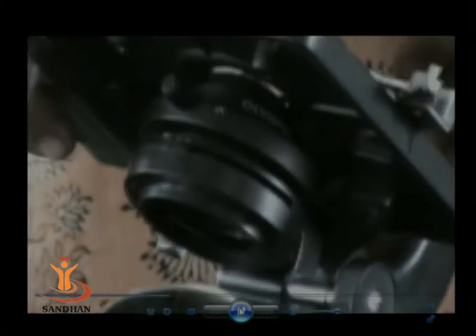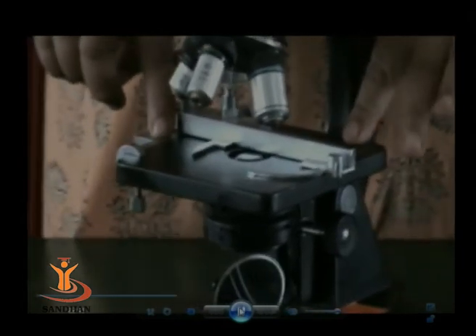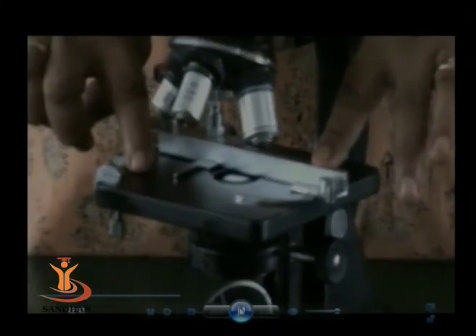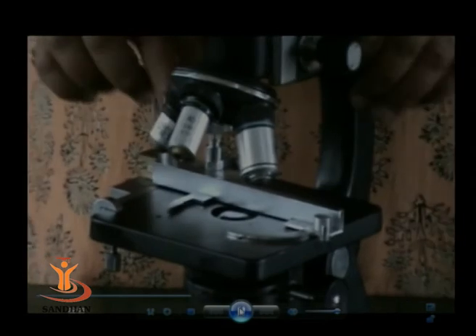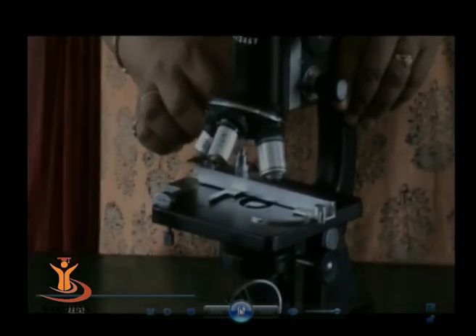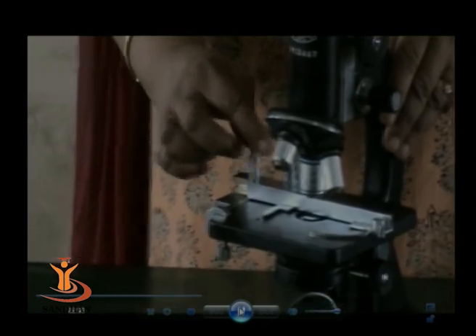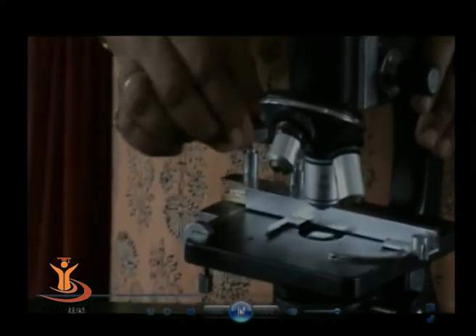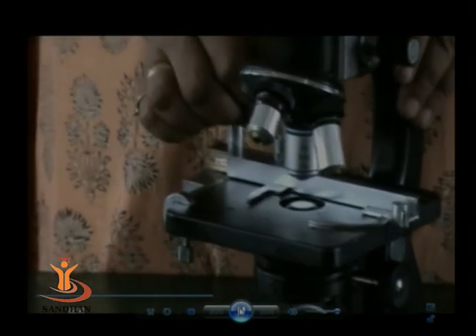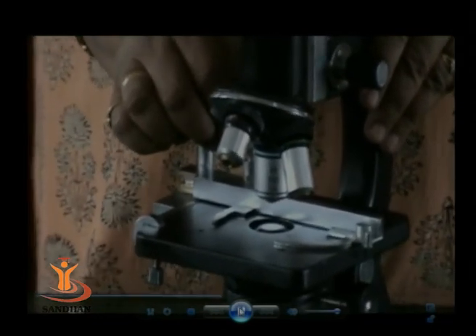So after the condenser, you can see this is the platform of the microscope, and on this platform we can mount the object. As you know, the object is there in the microbiology laboratory in the form of the slide. So the slide can be mounted on the platform of the microscope, and for convenience, this platform also has one extra arrangement in the form of a mechanical stage. You can see this is the mechanical stage, and it can be moved up or down, or sideways. That is, x-axis and y-axis movement of the slide is possible with the help of this mechanical stage. And this is very helpful in observing the complete smear without disturbing the initial adjustment of the microscope.